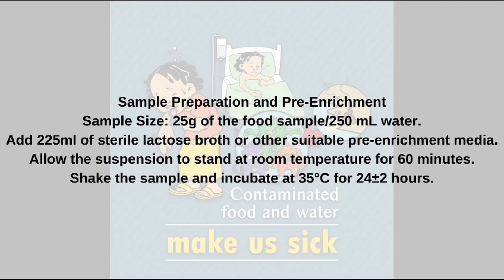After doing all these processes, we have to shake the samples and adjust the pH if necessary to between 6.6 and 7.0, with sterile 1 normal NaOH or 1 normal HCl. After which we will incubate the pre-enriched samples at 35 degrees Celsius for a period of 24 hours.